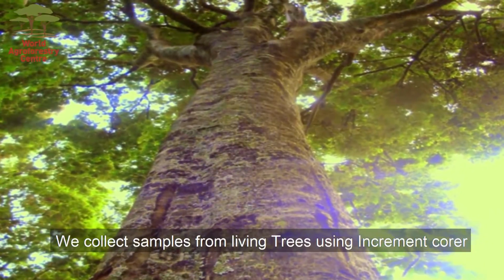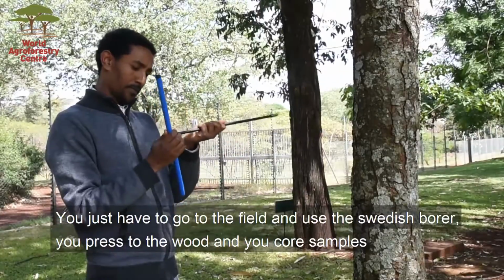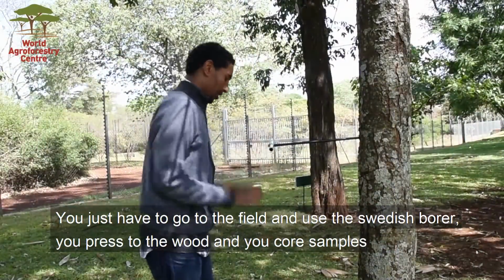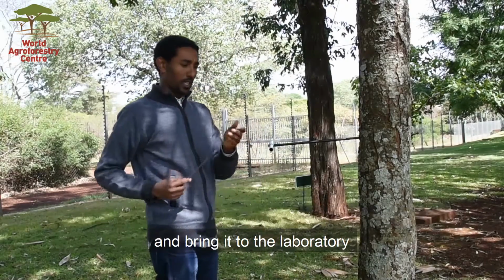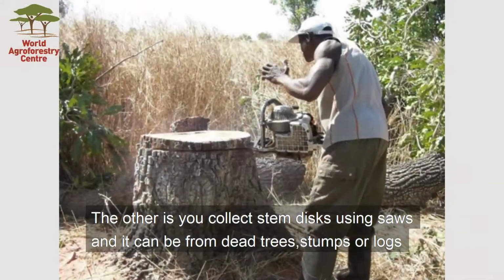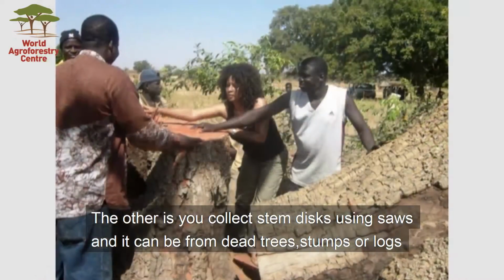Basically, we collect samples from living trees using increment cores. You just have to go to the field and use the Swedish borer. You press it to the wood, take a core sample, and bring it to the laboratory. The other way is to collect stem discs using saws, and it can be from dead trees, stumps or logs.